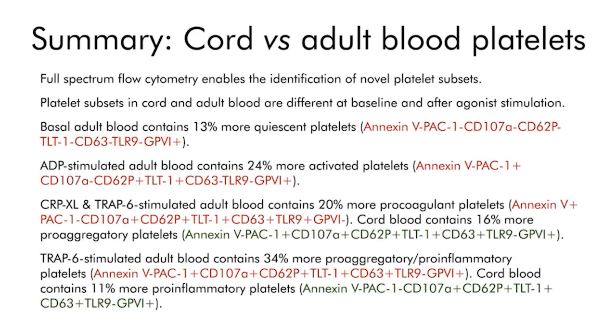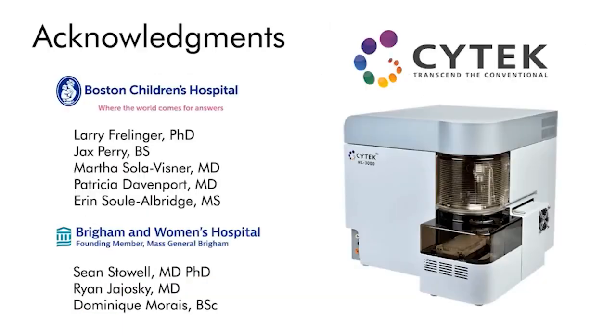And this was an encouraging first application of the assay. And so far, the assay has performed very robustly across a range of different sample types, including thrombocytopenic samples, which have very low platelet counts.